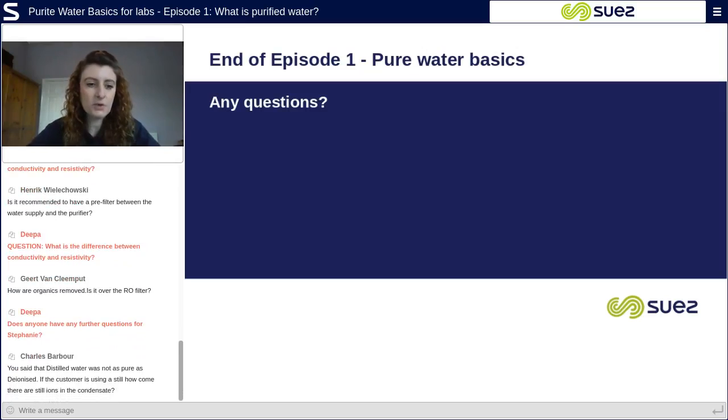You said that distilled water was not as pure as deionized water. If the customer is using a still, how come there are still ions in the condensate? Yes, that's true. This is just due to the distilling process.